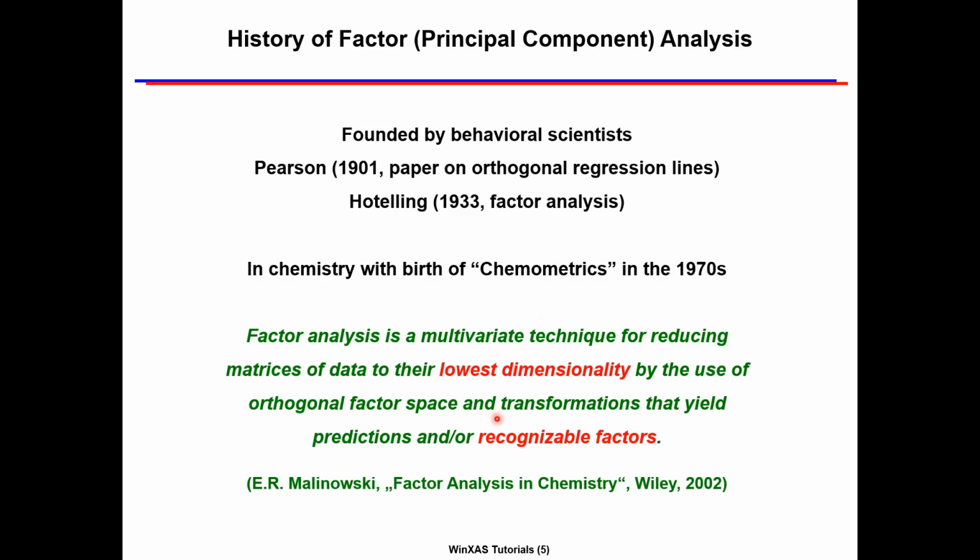A definition of factor analysis states that it reduces data to their lowest dimensionality, which is the number of chemical phases in our phase mixtures, by means that yield recognizable factors, which is the chemical identity of the phases present in the samples. This seems to be exactly what we need for a reliable quantification. So let's see how this is achieved.